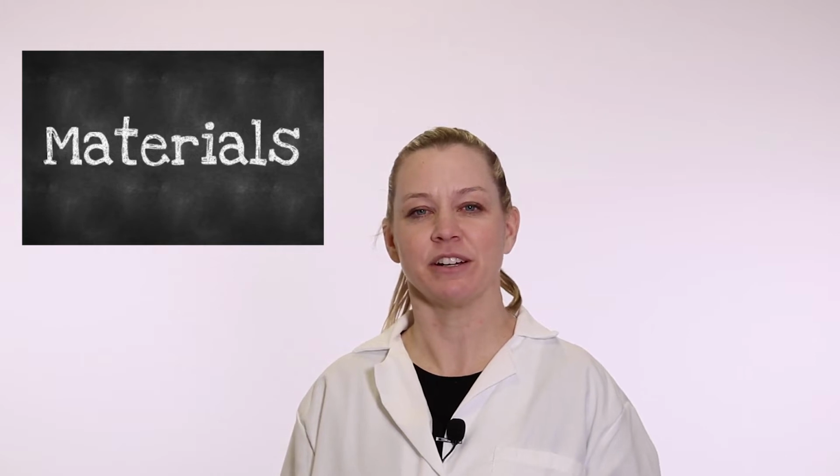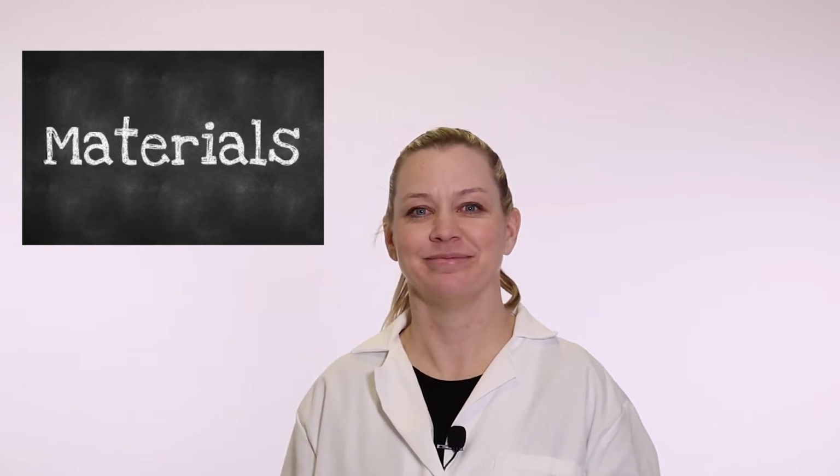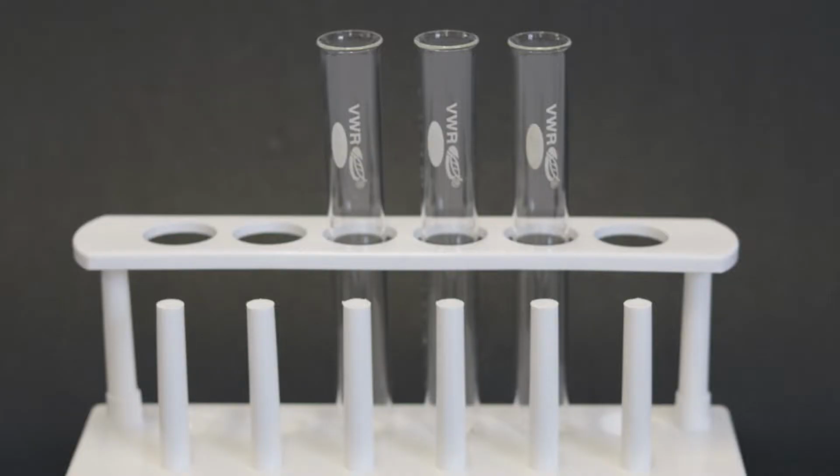Let's take a look at the materials needed for this lab. Test tubes held in place by a test tube rack. Make sure the test tubes are clearly labeled so the correct solution goes into the correct test tube. You can use masking tape to wrap around each test tube to clearly identify the solution.